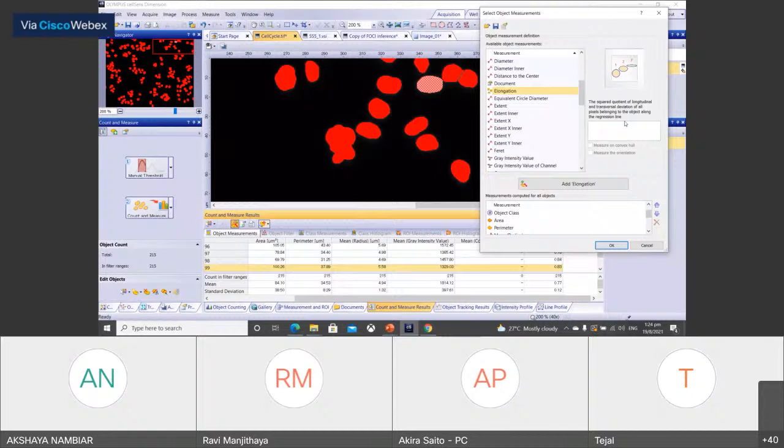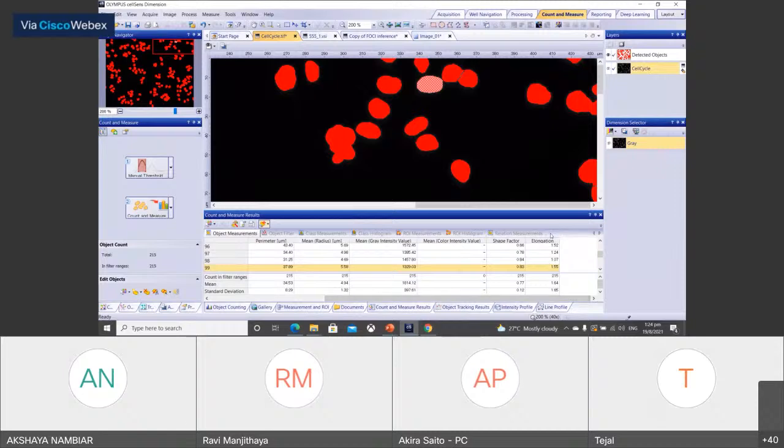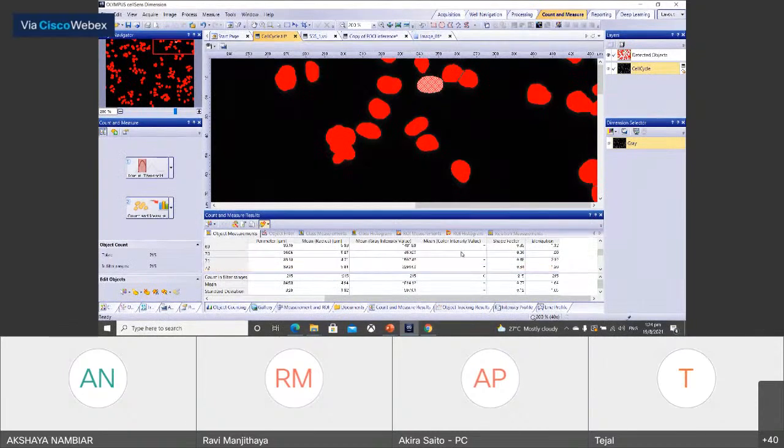So it will have a very elongated nucleus or object. So we just add it over here, and then you can find that information in each object.